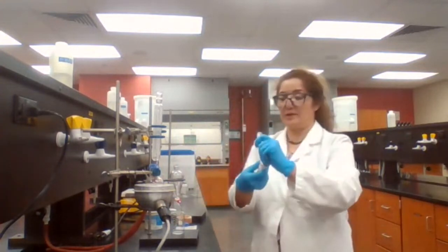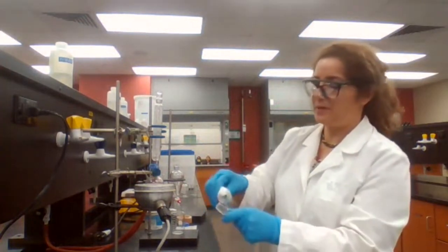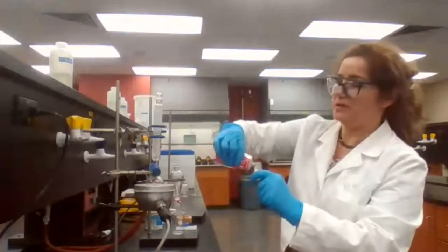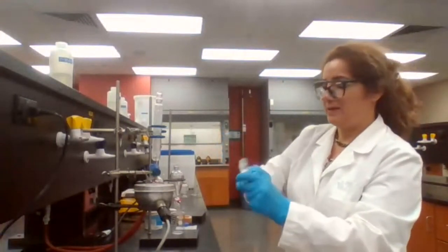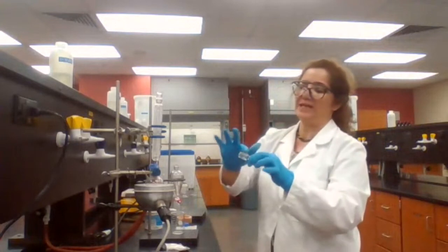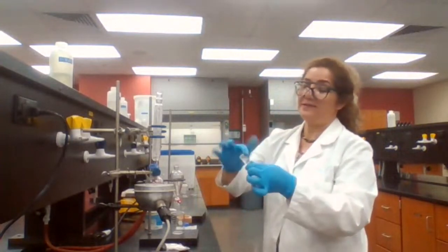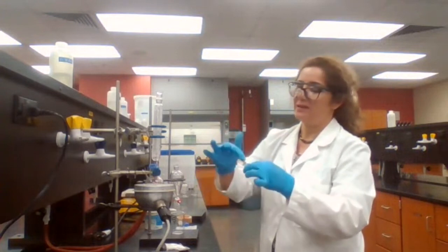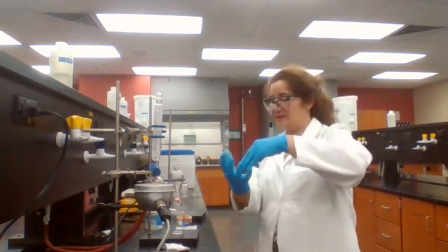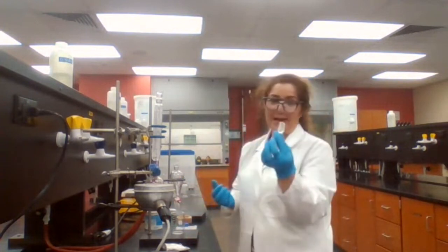The cap for the separator funnel also must be greased, because if it's not greased, when you turn it around and do the shaking part, if it's not completely sealed, then you would get that liquid leaking out into your hand. You don't want to do that.